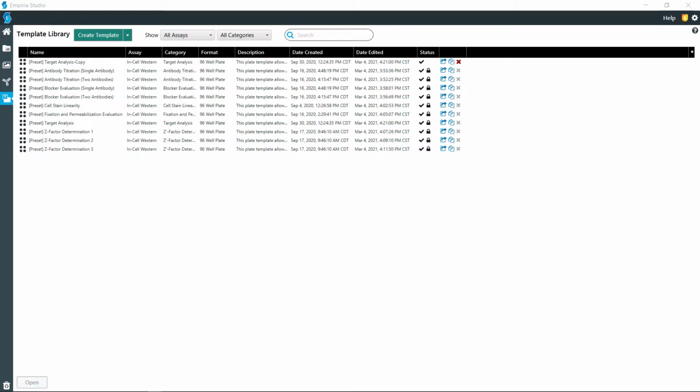In this video, I'll be taking you through the steps involved with setting up a template for Z-factor determination for In-Cell Western. And so here on the template library, you will notice that it does come with 3 presets for Z-factor. They all are basically the same, just different order in which the wells are laid out.